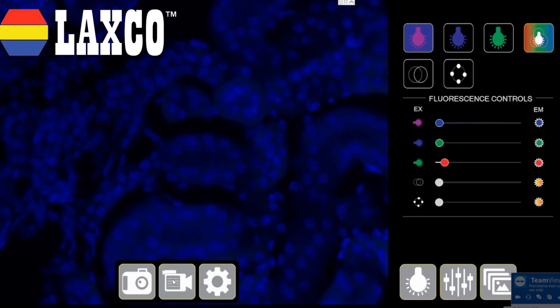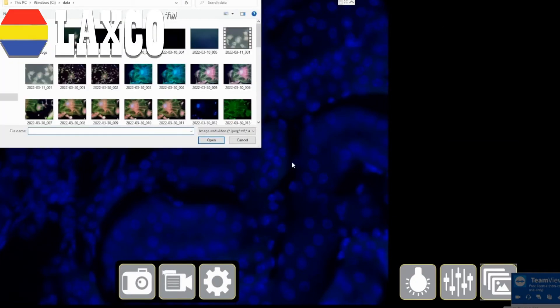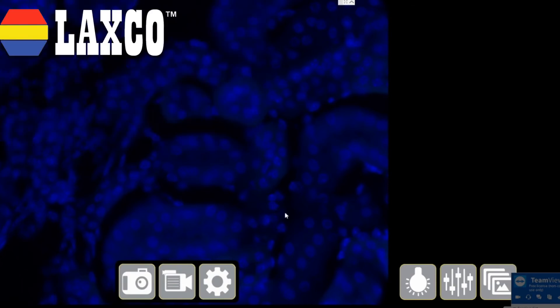This is my video capture button. This is useful when it comes to live cell imaging. I press it and the video starts recording. I press it again and the video stops recording. This is great for doing time-lapse imaging, and it stores itself at the same location.